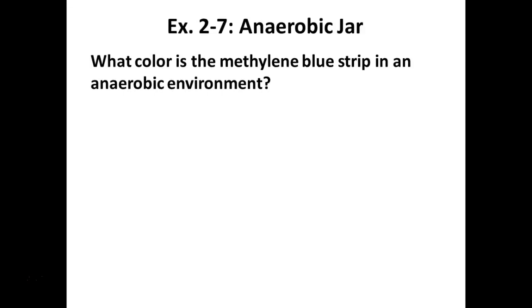Anaerobic jar. So methylene blue strips are commonly used, or in the case of my gas packs, it comes with a methylene blue tablet. So it has methylene blue in it. This one's really getting old, so you really can't see the blue tablet all that well. But under anaerobic conditions, what color does that tablet become? It'll become colorless. Again, can we see if this jar is anaerobic or not? No, not with our eyes. We can't see molecular oxygen, so we need an indicator. In this case, it's methylene blue.